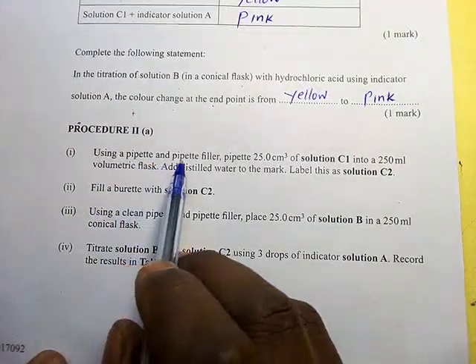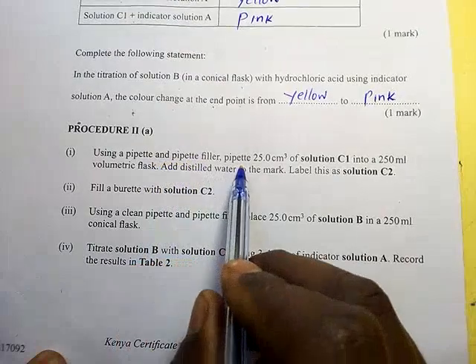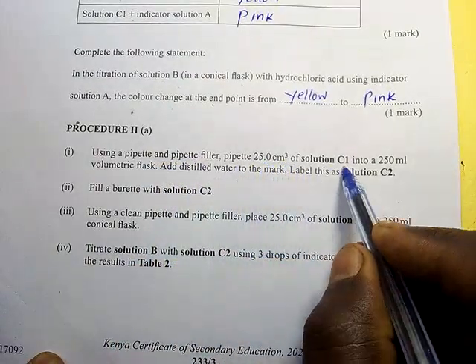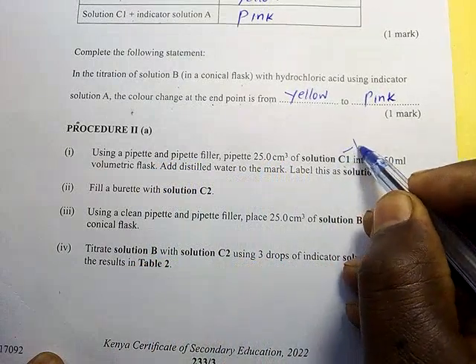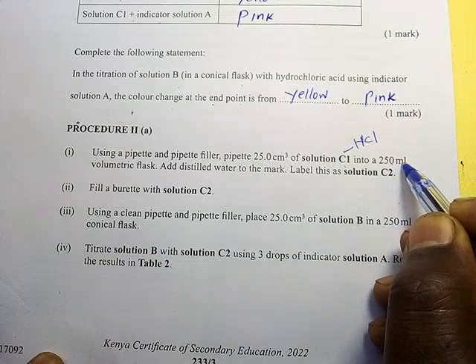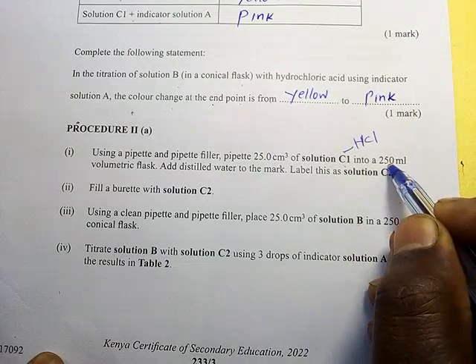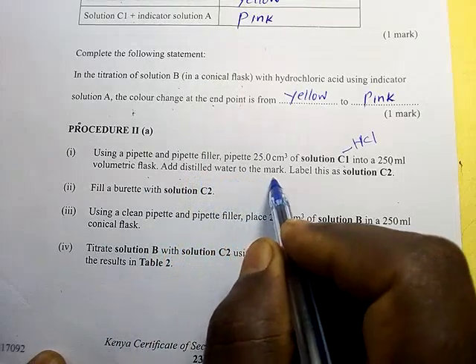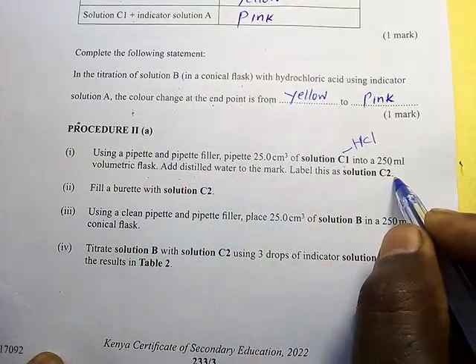Using a pipette and a pipette filler, pipette 25 cm cube of solution C1. C1, remember, is an acid, HCl. You should know that. Put it into a 250 ml volumetric flask. Add distilled water to the mark. Label this solution C2.